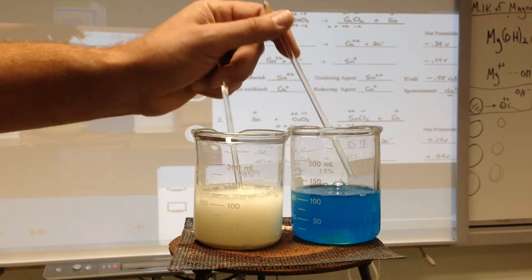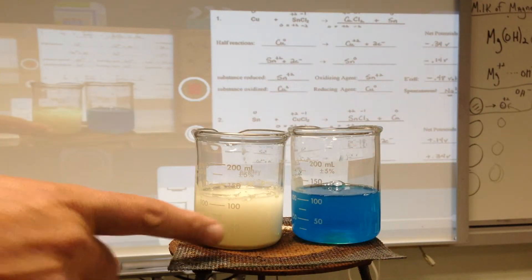Now, I've got these two solutions. You have copper plus two in this beaker and tin plus two in this beaker. What we're going to do is put some metals in there.